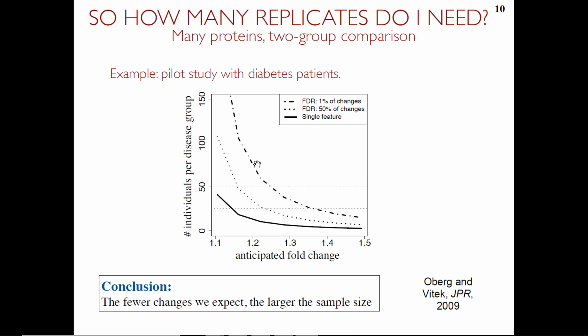So you can have a part of your protocol that, let's say you do a DIA, right? I don't know if there's a value in this, but at least from the statistical perspective, it would work. Let's say you do DIA and you say, I'm quantifying 10,000 proteins and I deliberately remove the first 1,000 most abundant because I don't care. Yeah. I would probably want to keep them, maybe it's useful, right? But if you really say you only want to, in that sense, you would be doing a targeted experiment, right? Because you would be only targeting certain analytes and ignoring everything else. In actual SRM, you will ignore it experimentally, right? You just won't even select these ions. So what you are saying is ignoring them essentially from the data analysis, right?